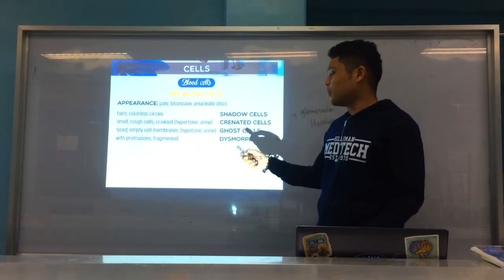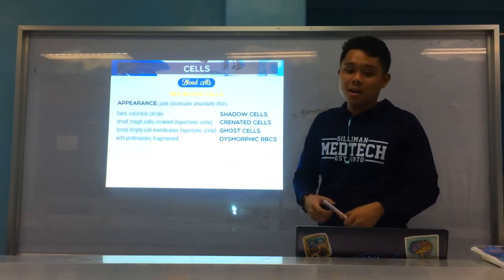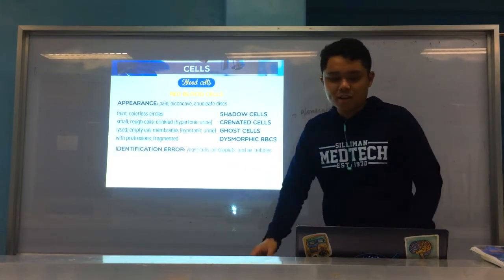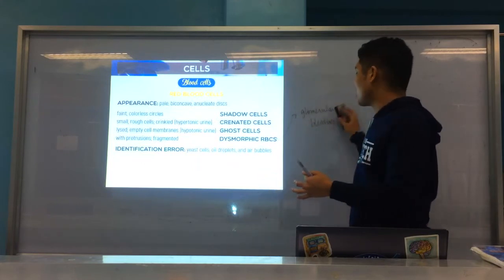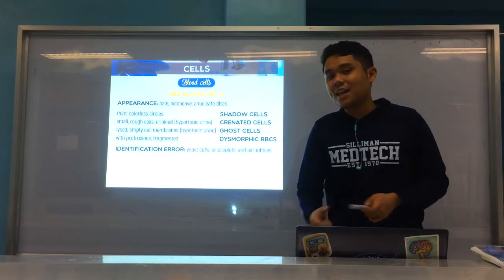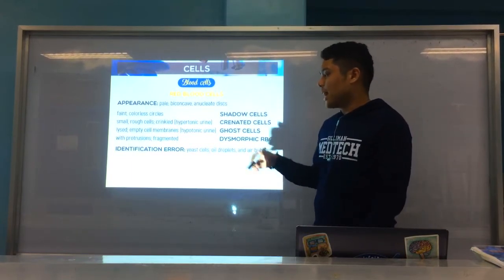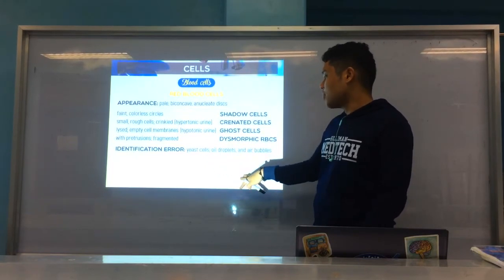Okay? So again, dysmorphic RBCs are usually indicative of glomerular bleeding. And for identification errors, you can mistake them for yeast cells, oil droplets, and air bubbles, because again, they look quite the same. We have pictures in the next slides for that.